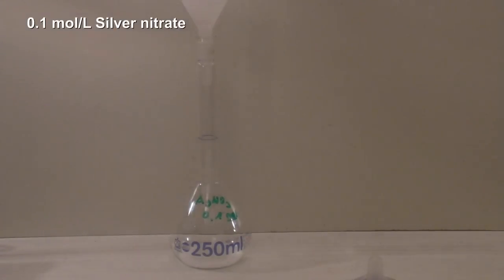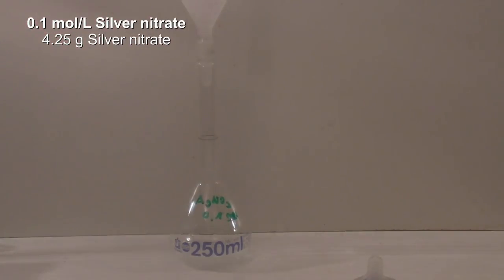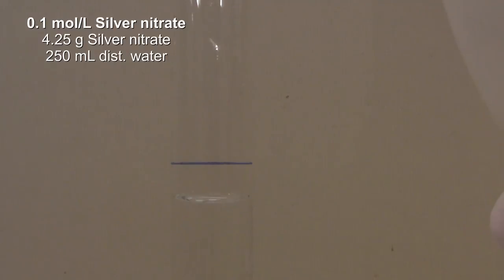The second one is a 0.1 molar silver nitrate solution. This was made by dissolving 4.25 grams of silver nitrate in 250 milliliters of distilled water. The water content of the silver nitrate was neglected because the concentration of this solution was going to be measured. This solution has to be stored in the dark because silver nitrate is sensitive to light.